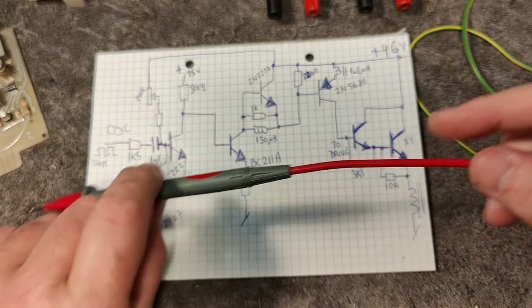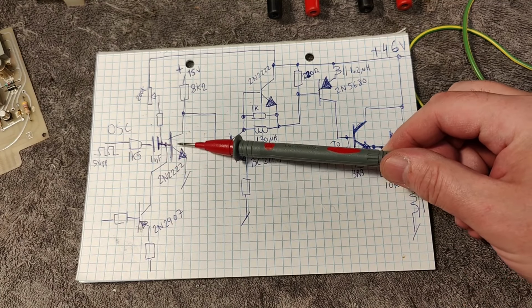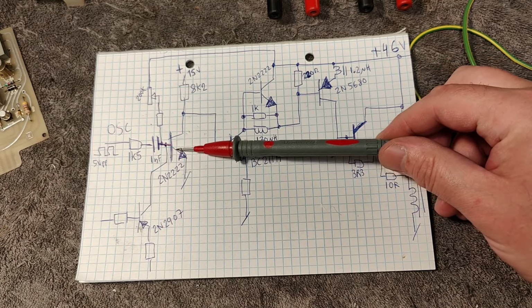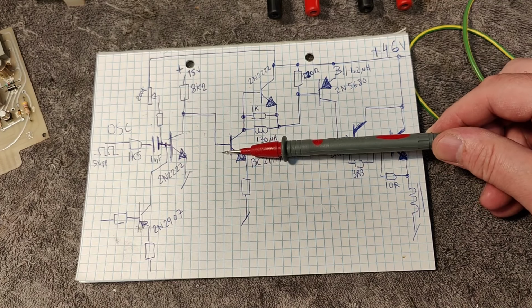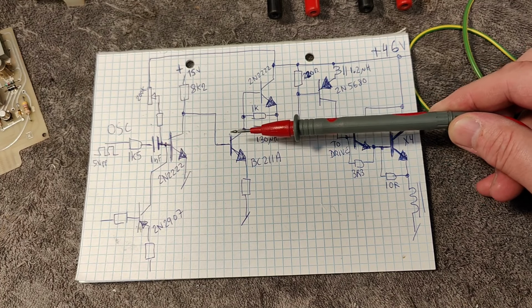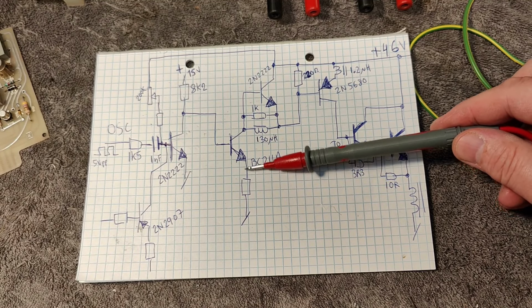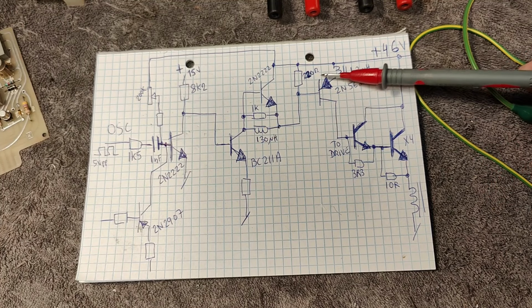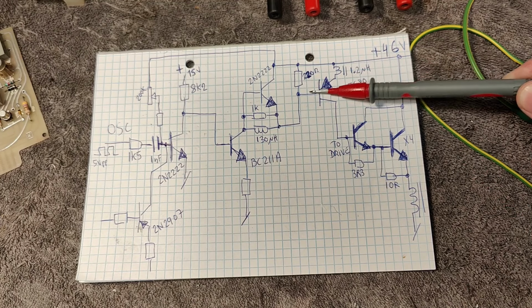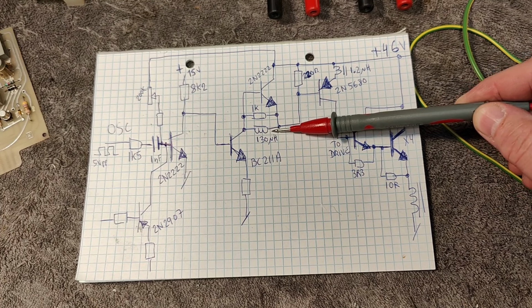So, my oscillator signal comes here. It's AC coupled. It goes to my first little inverter driver. So there's just a high voltage here. And then my pulses just goes straight here. Pulse, pulse, pulse. And then you'll see the signal here pulls down, and there's a resistor right here. So this is a current generator, and this pulls the base active this way. So this current that flows this way actually energizes this inductor.